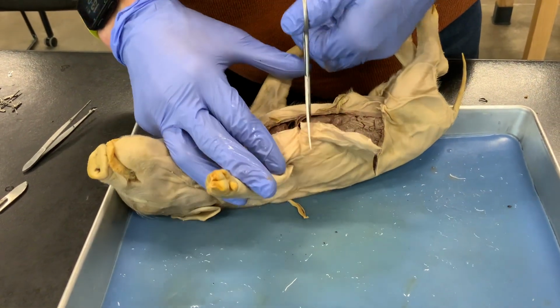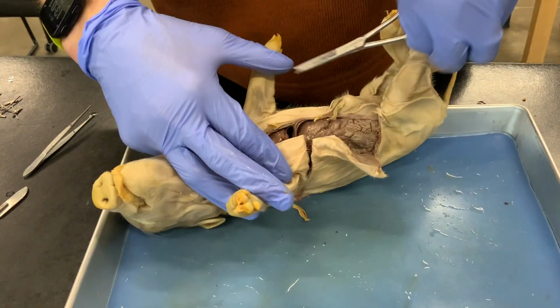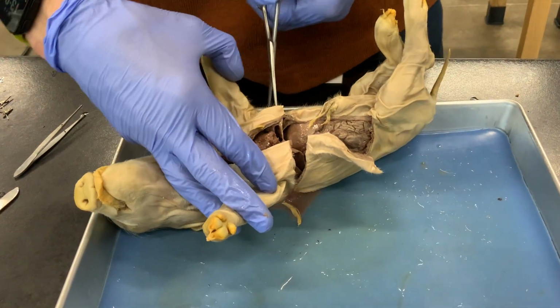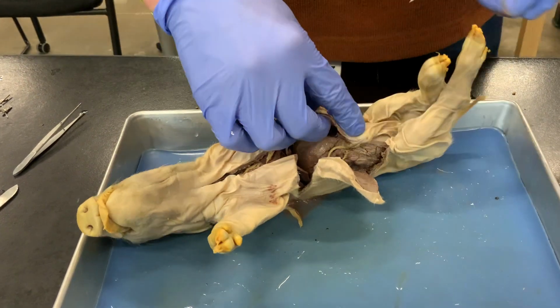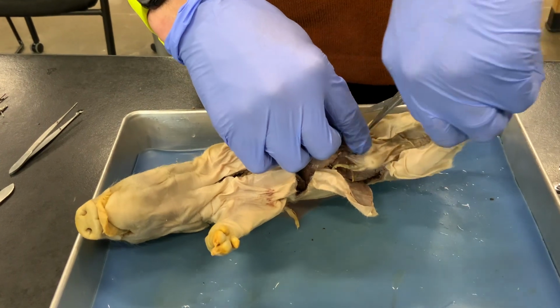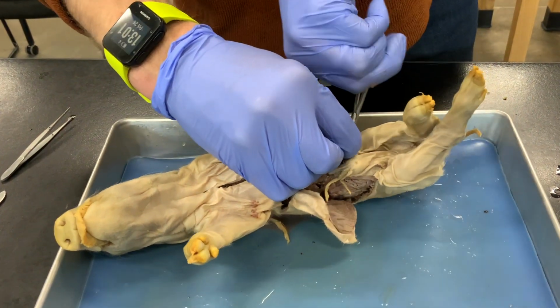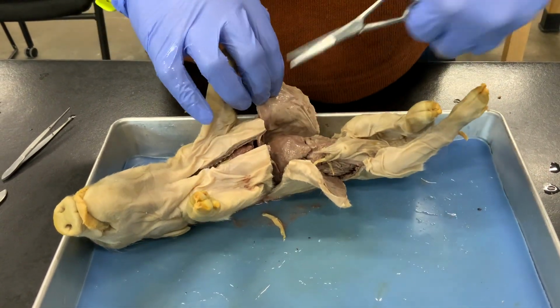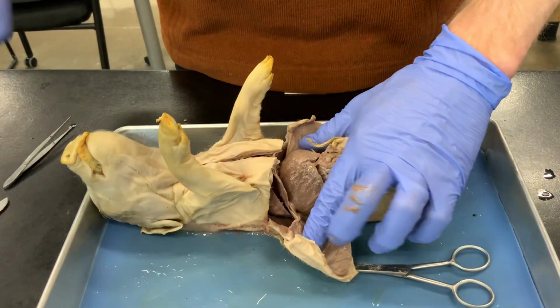And at the back of the ribs, to separate the abdominal and thoracic cavity, we'll make a second cut here. And I'll repeat the same pattern on the other side of the animal, just in front of the hind limbs. And then we will pin the body cavity open.